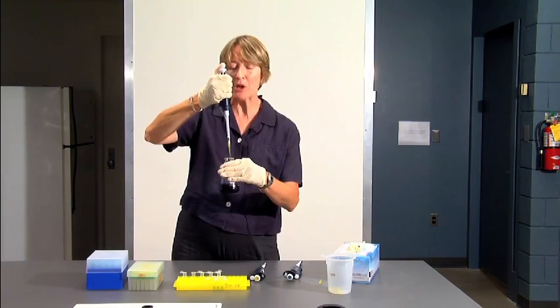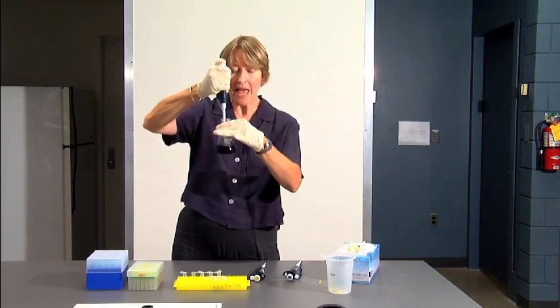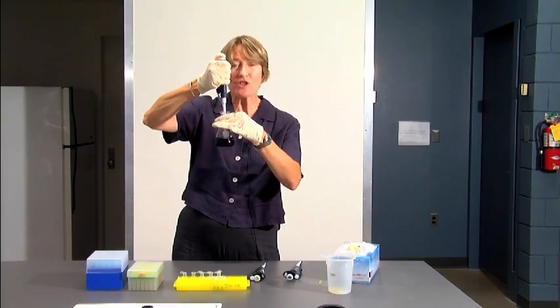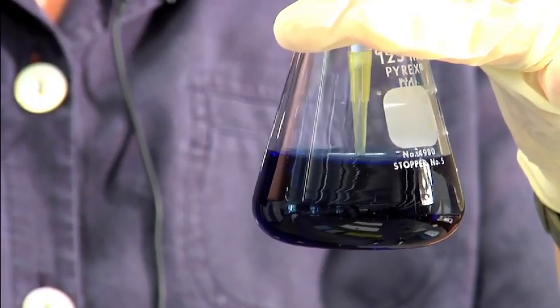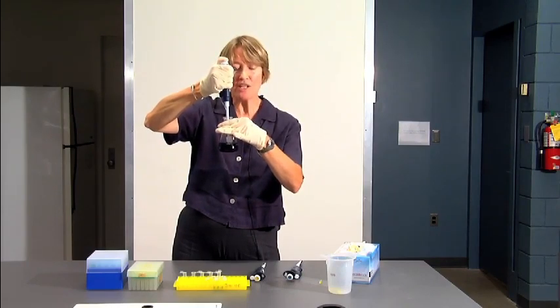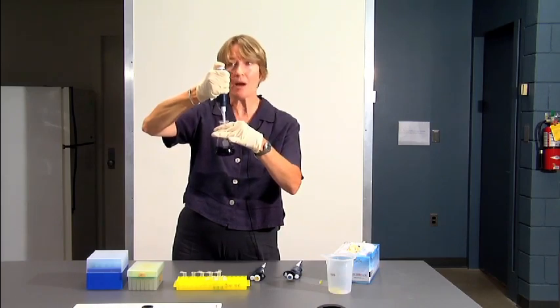You're going to depress the plunger to the first stop, put the pipette tip into the fluid, and you want to make sure that your tip is below the surface of the fluid, well below the surface of the fluid. You don't want to get the pipetter itself wet. You don't want it to go in too deep, but you want it to go in deep enough so that when you pull up the liquid into the tip, you're not sucking up air. You don't want to get bubbles in the tip.